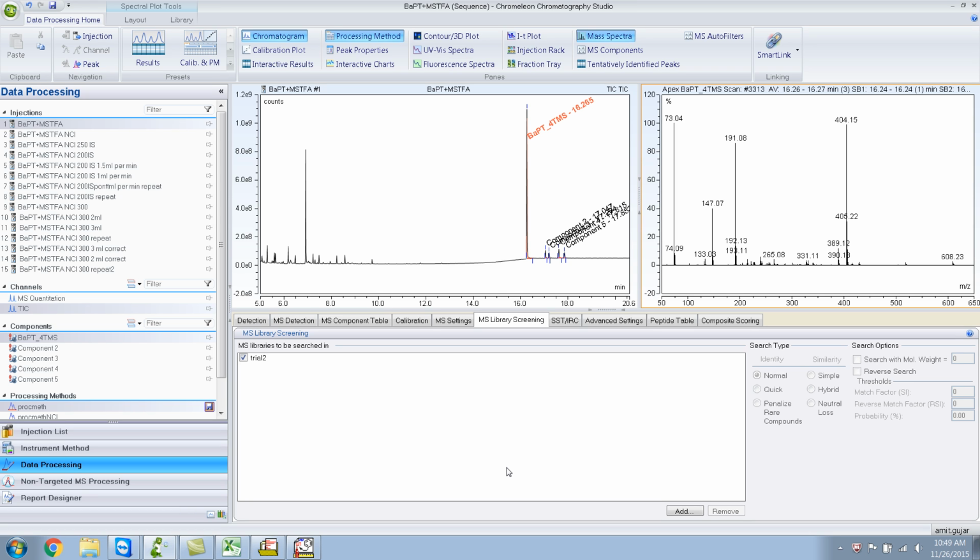Anyway, hopefully this video has taught you how to make your own custom library. This could be for various reasons. You're dealing with a new molecule, and you're analyzing the molecule in your sample, and you want to make sure that it has a good hit. Anyway, I think I'll stop this video now.